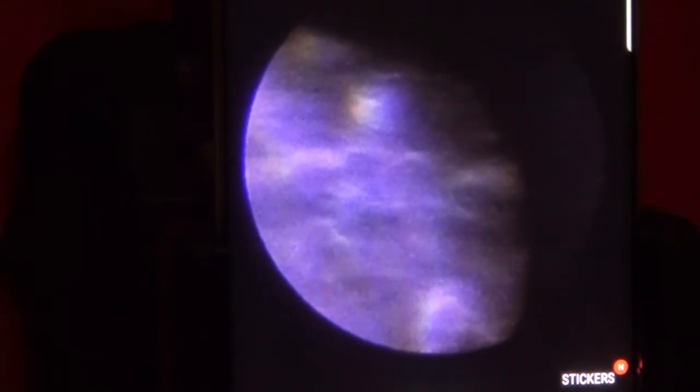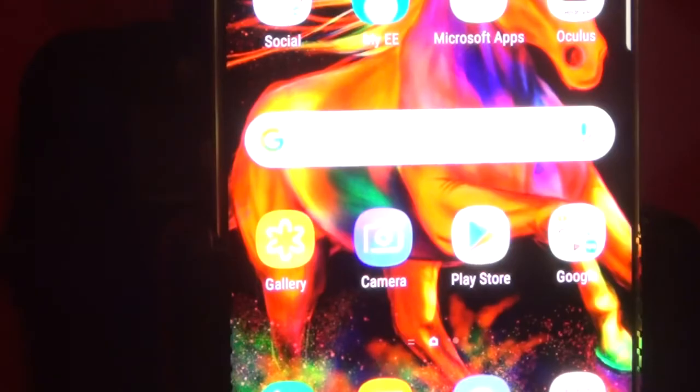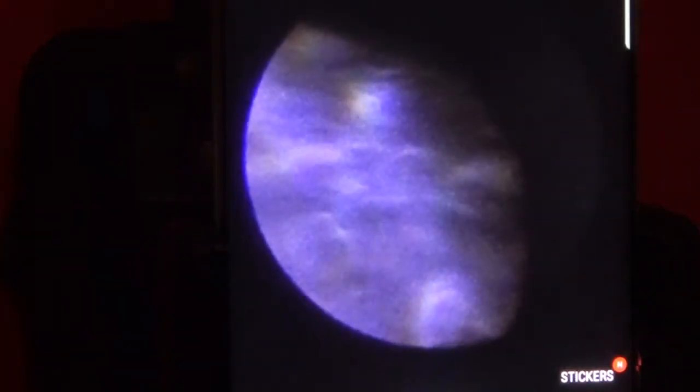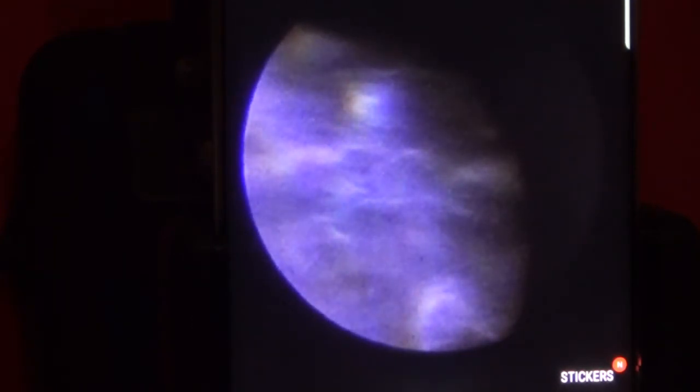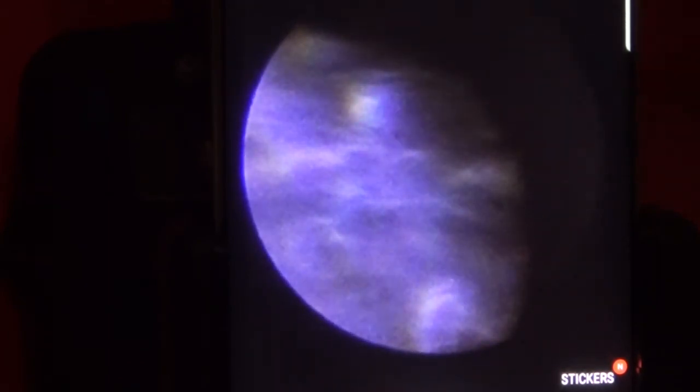You gotta learn how to focus it, but it should be easy enough. This is the one thing I like about microscopes that you can mount a phone onto — you can make really nice microscopic videos. That's not the best quality because I didn't focus it right, just trying to show it for the review. But it is pretty good for what it is. The actual microscope is really good quality and hard-wearing, especially because it's got a rubberized feel to it instead of the cheap plastic microscopes you get on the cheap. There's good workmanship in this one.